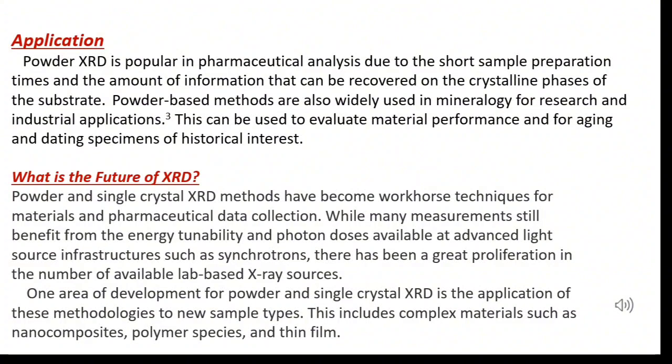Powder and single crystal X-ray diffraction methods have become workhorse techniques for material and pharmaceutical data collection. While many measurements still benefit from the energy tunability and photon dose available at advanced light source infrastructures such as synchrotrons, there has been a great proliferation in the number of available lab-based X-ray sources.